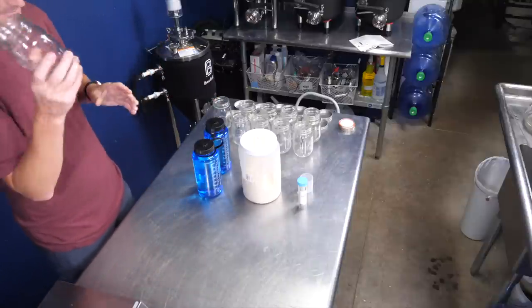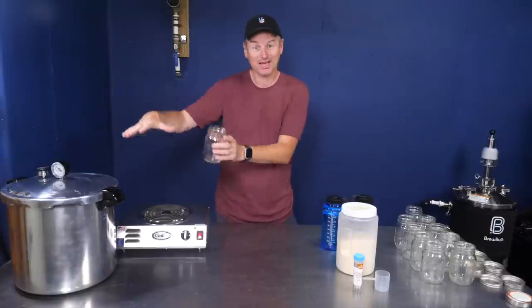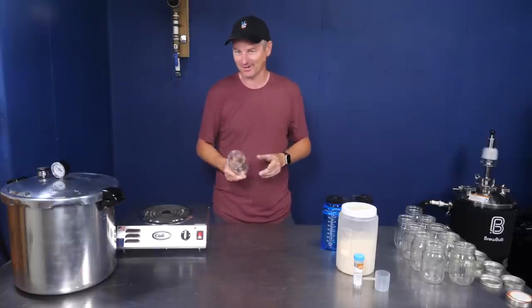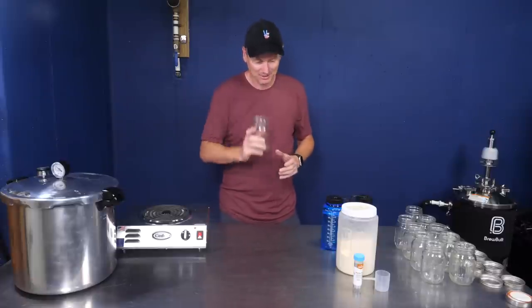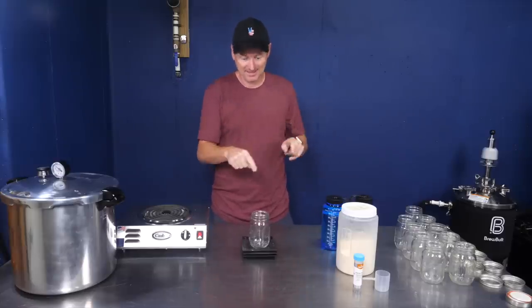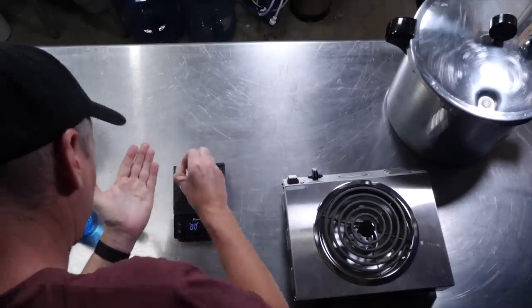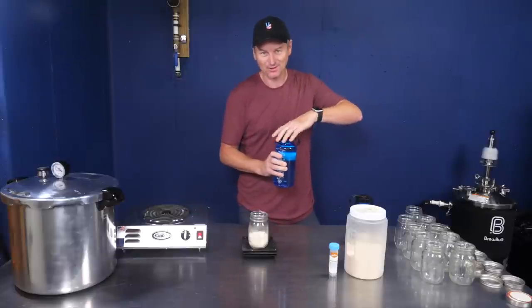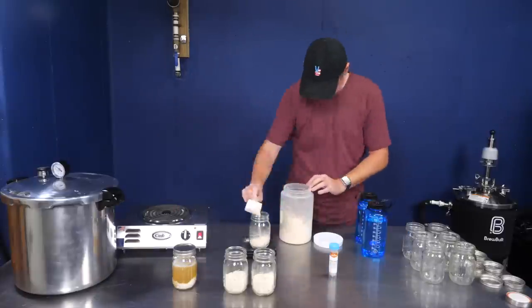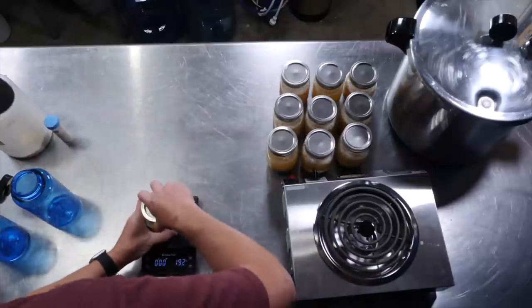I'm going to make 10 mason jars — that's because 10 fit on the bottom layer of my pressure canner. I could add a second layer for 20, but I probably won't need 20 litres of yeast starter anytime soon. The first step is to add four ounces of light DME into each mason jar, then a scientific sprinkle of yeast nutrient, then eight ounces or 240 millilitres of water. Just need to do that nine more times.